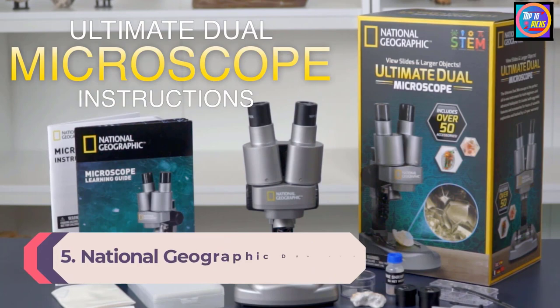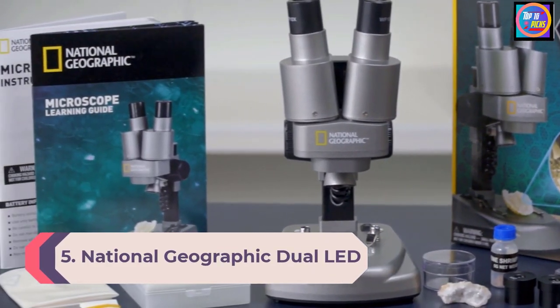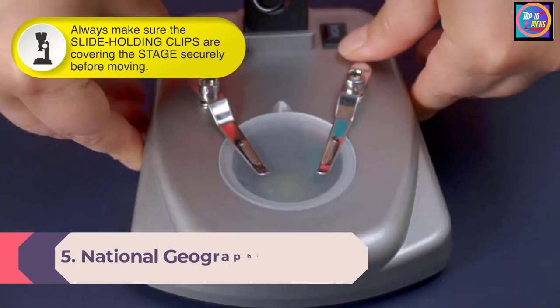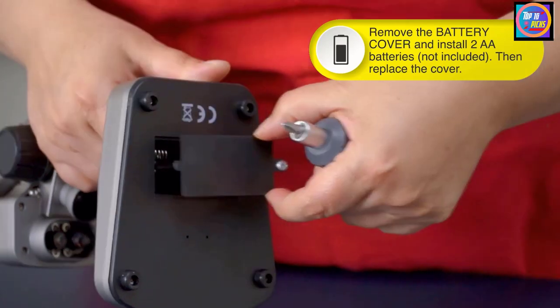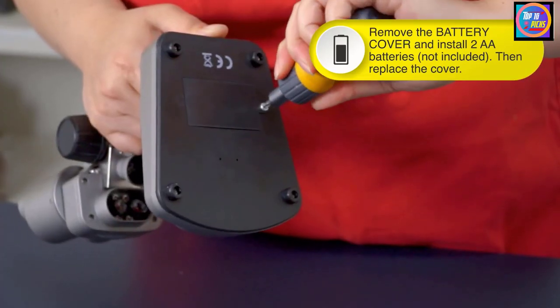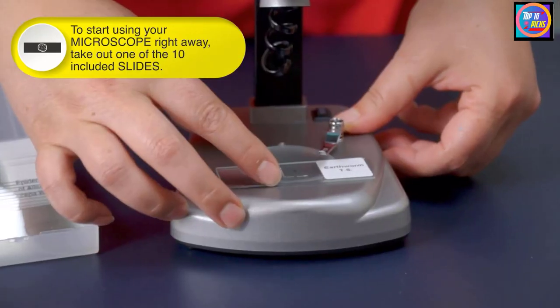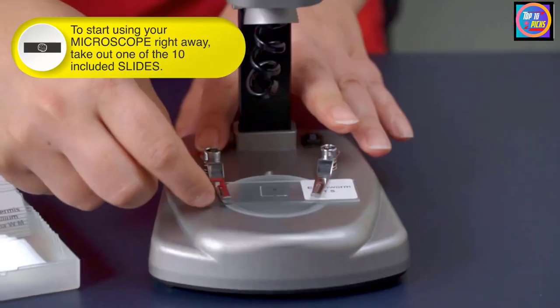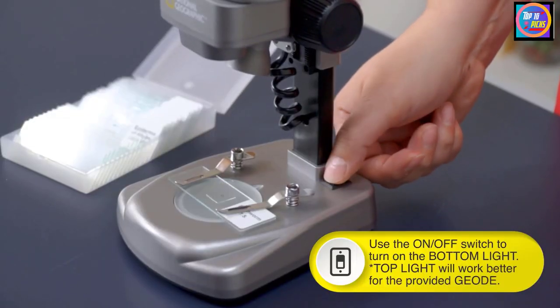Number 5. National Geographic Dual LED Student Microscope. This microscope comes with high-quality glass optics for 20x and 50x magnification. With only two settings to choose from, a child will quickly understand how to use the microscope without always needing adult supervision. Its highest magnification lets you see 5mm within the object, which allows a fun insight without making the vision too complex for children.